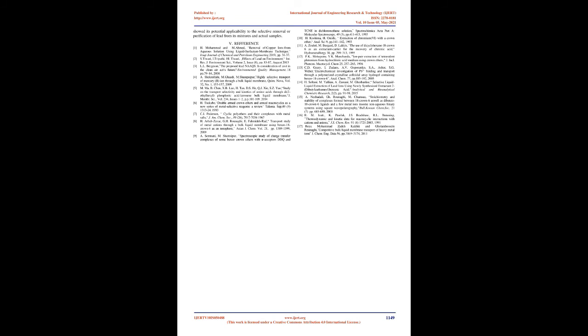Application of the proposed procedure on collected soil samples. Based on the preliminary results, the final procedure was proposed for investigation of extraction possibility from the river sediment samples. 10 ml of the sample solution at pH equals 1, the original pH of samples after digestion, also contained 1×10⁻³ mol/L of picrates, and the feed solution was mixed with 50 ml of dichloromethane as organic solvent, containing 1×10⁻³ mol/L DCH18C6 as ligand.